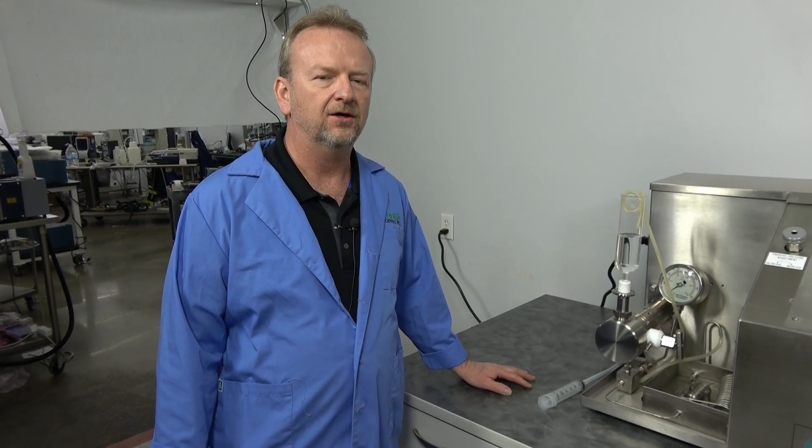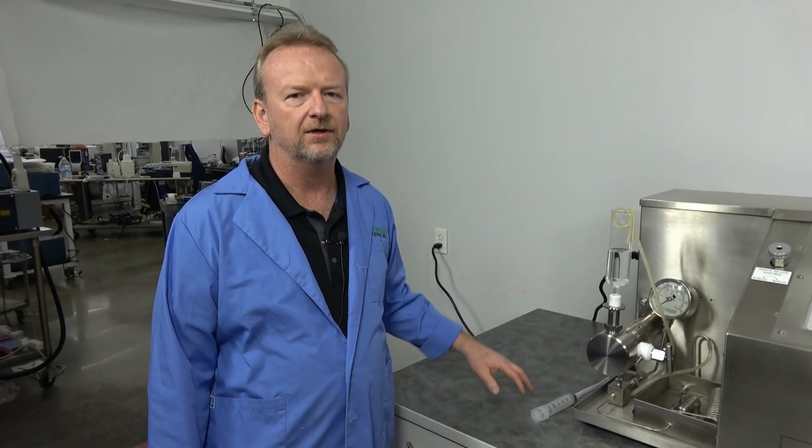This is definitely the answer for those who really don't want to mess with air. They just want to plug it in, turn it on, and get it going.